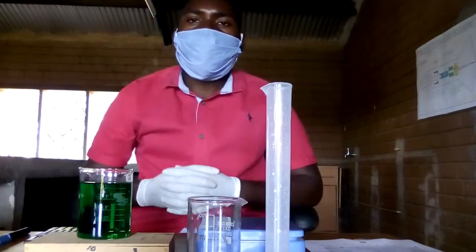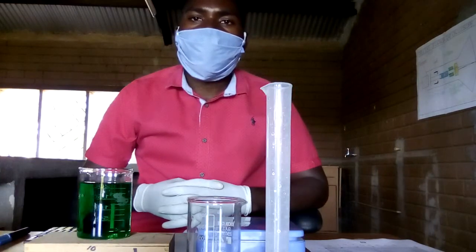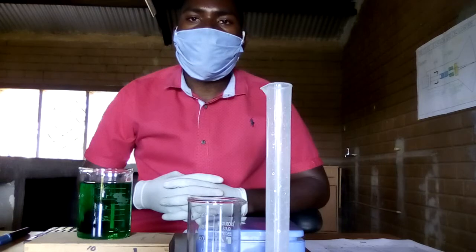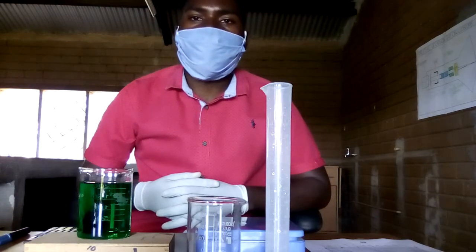Hello there. Today I want you to join me in this video and learn how to calculate or find the mass of the unknown liquid.